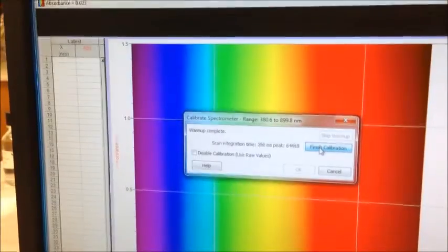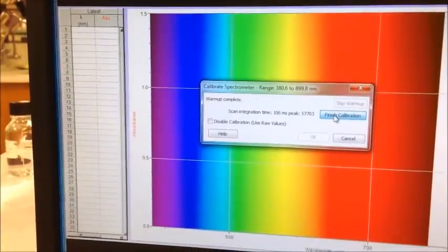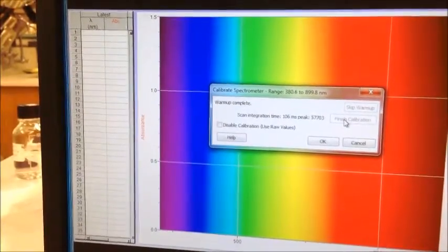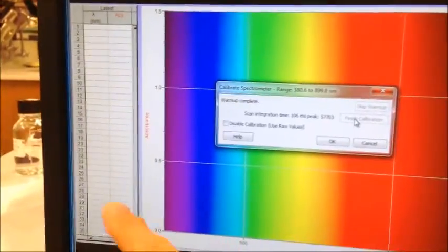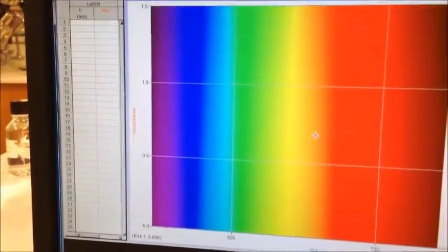So what is the computer actually doing when it's finishing the calibration? What it's doing is scanning and finding out how much light is absorbed at every wavelength across the spectrum, and then it stores that information into its memory.